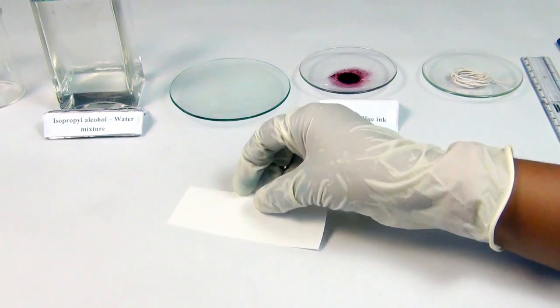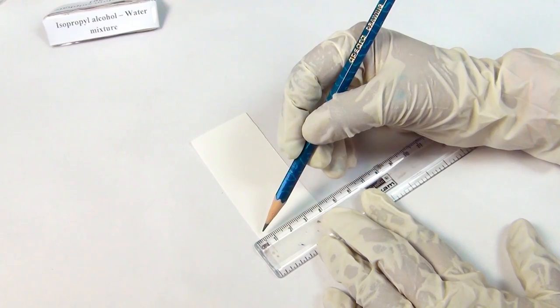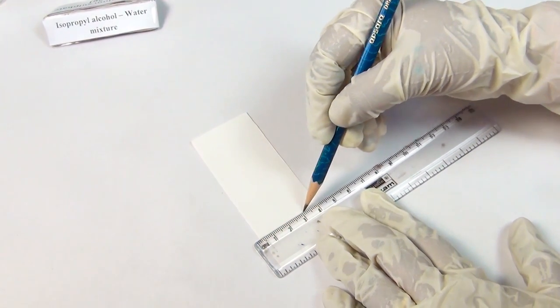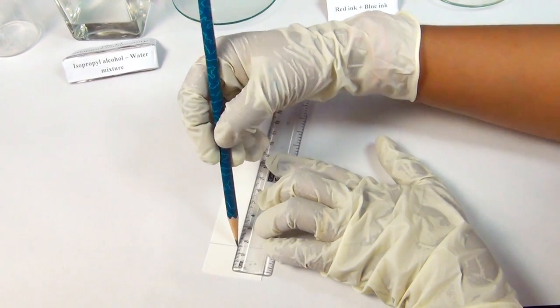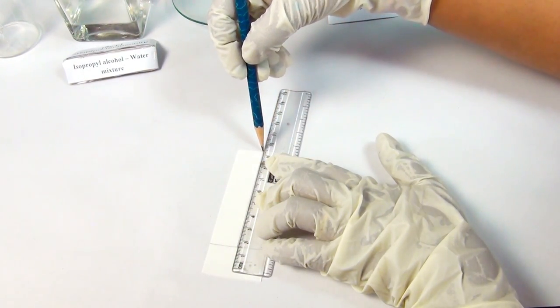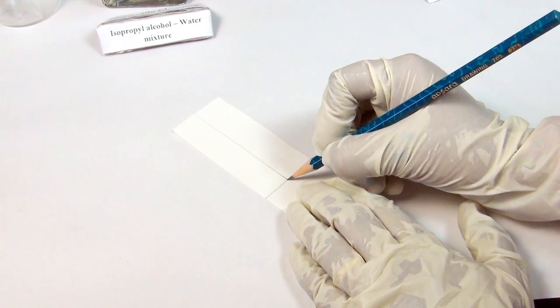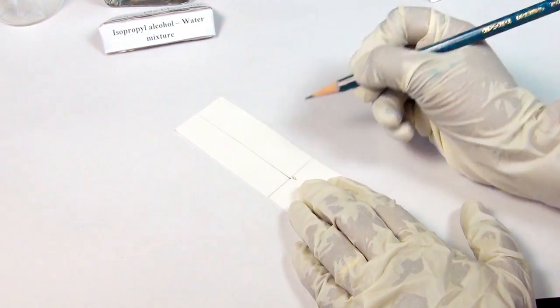Procedure: Take a Whatman filter paper strip and draw a line with a pencil about 2 cm from one end. Draw another line lengthwise from the centre of the paper. Name the point at which the two lines intersect as P.